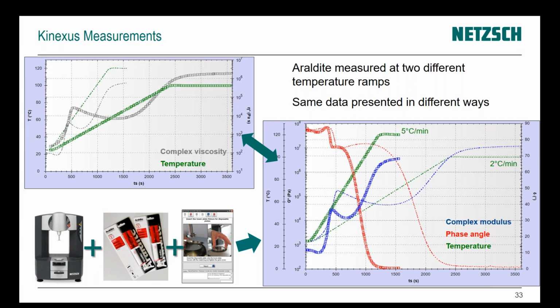In this case, 2 different conditions are 2 different temperature ramp rates. A relatively rapid 5 degrees C a minute, and then obviously a little bit slower, 2 degrees a minute. So what we'll do is effectively we load the material. Yes, the material is curing.